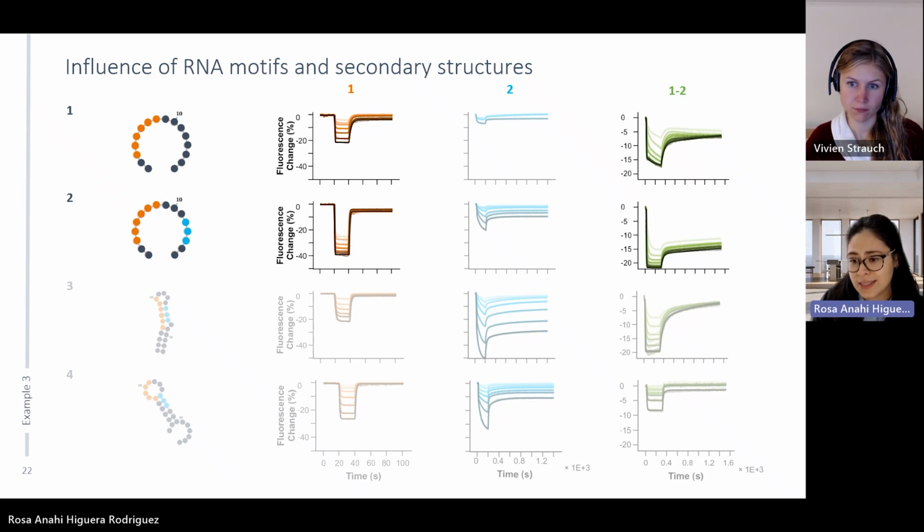the structural ligands. And this we could explain because in the linear ligands, the binding motifs are more exposed to the protein compared to the secondary structural ligands, where actually the binding motifs were engaged in forming the secondary structure. So we can see it very nicely in this ligand number 2, where actually the off rate is very, very slow and the binding is very tight in this case.